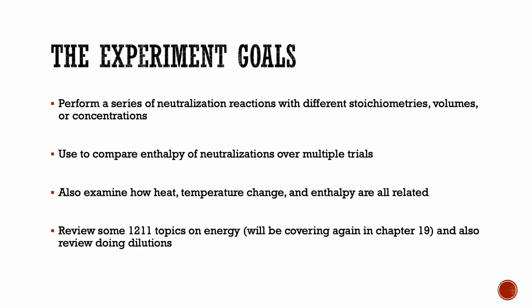Those things will both pop up again a little bit in chapter 19 that we'll get to pretty shortly in the lectures. And also, hopefully this week, you will be doing some dilutions, and that's something to pay attention to because almost all of the acid and base solutions that are going to be set out for you in the hood to work with, probably none of them will be the concentration you actually need to use for any of your trials, so you will be having to do some dilutions this week. So hopefully it'll be a good review, just the general solution-making processes.